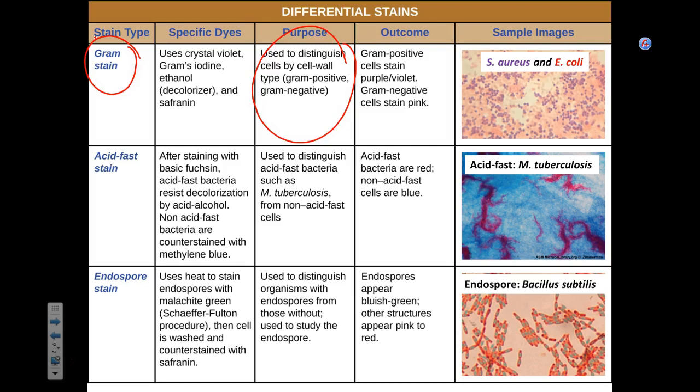in the morning and there is a blood sample, not blood culture, blood sample from a patient who is really, really sick. Blood culture is already started, to cultivate it, but you need to do something. What are you going to do? Let's say we're going to do Gram stain. It's going to give us the information whether the patient has a Gram-positive or Gram-negative infection. And based on this, the physician can direct a specific type of antibiotics. At least that gets the treatment started. Does that make sense? Then you can do all the fancy stuff. We got it?